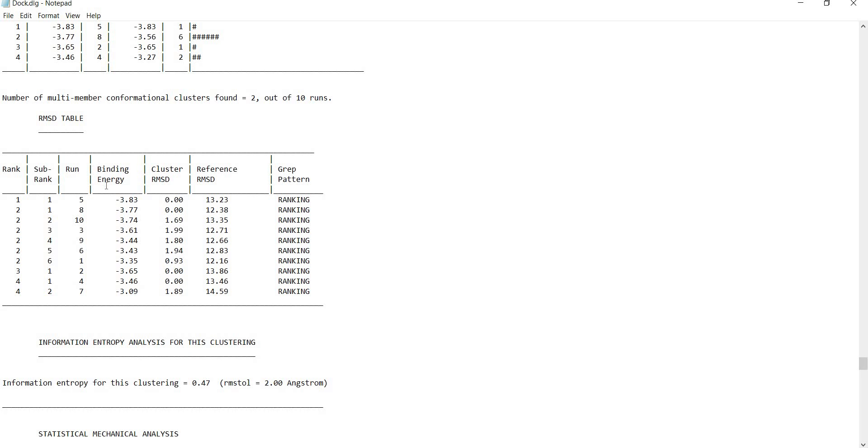The best pose is usually defined by the lowest binding energy value and these poses are ranked based on this binding energy value, lowest to highest. To extract this best pose, you need to scroll down.